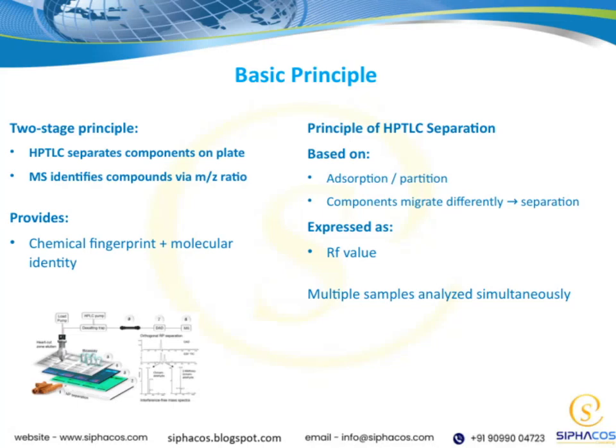Let's take a closer look at the principle of HPTLC separation. Essentially, this technique relies on the concepts of adsorption and partition. What that means is that different components in a mixture will migrate at different rates on the plate, leading to their separation. This process is expressed using what's called the RF value, which helps us identify and compare components based on how far they travel. An important aspect of HPTLC is that multiple samples can be analyzed simultaneously, making it a very efficient method.